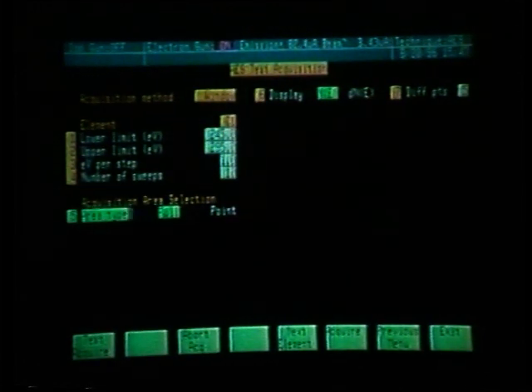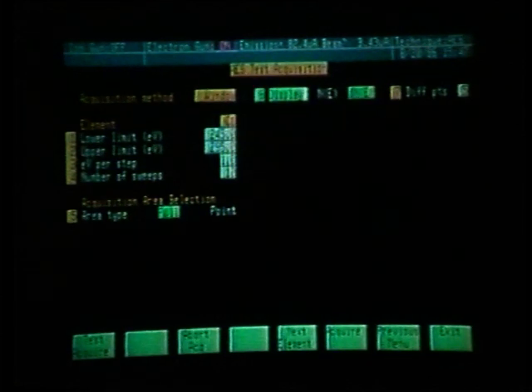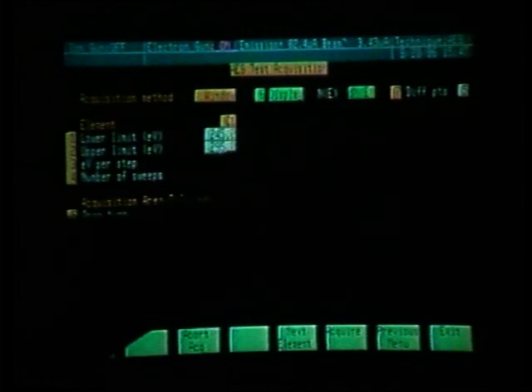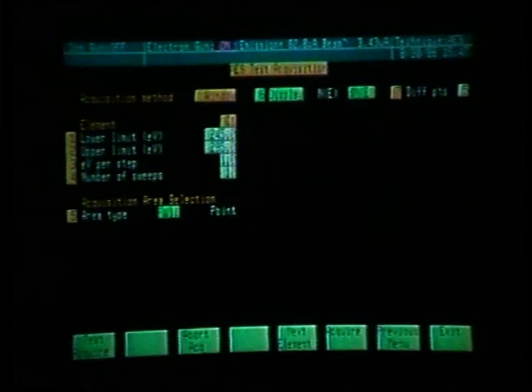Function key number 6 and toggle to dN of E. Function key 7, we want our differentiation points to be 5. We are now set to test acquire, which is soft key number 1.